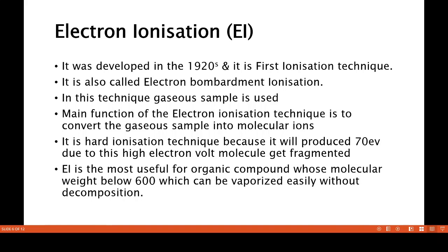In this technique, a gaseous sample is used. The main function of this electron ionization technique is to convert a gaseous sample into a molecular ion. In this technique, the energetic electrons interact with solid or gas phase atoms or molecules to produce the ion. This technique is called a hard ionization technique.